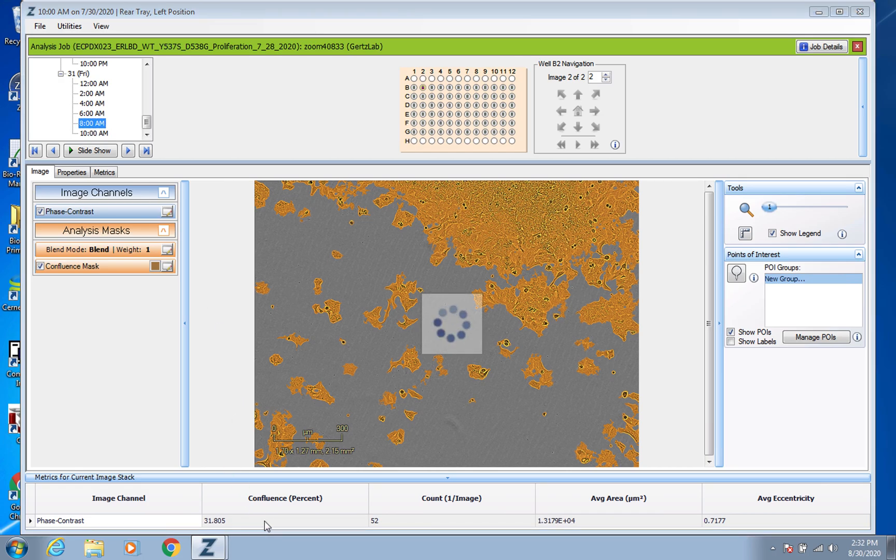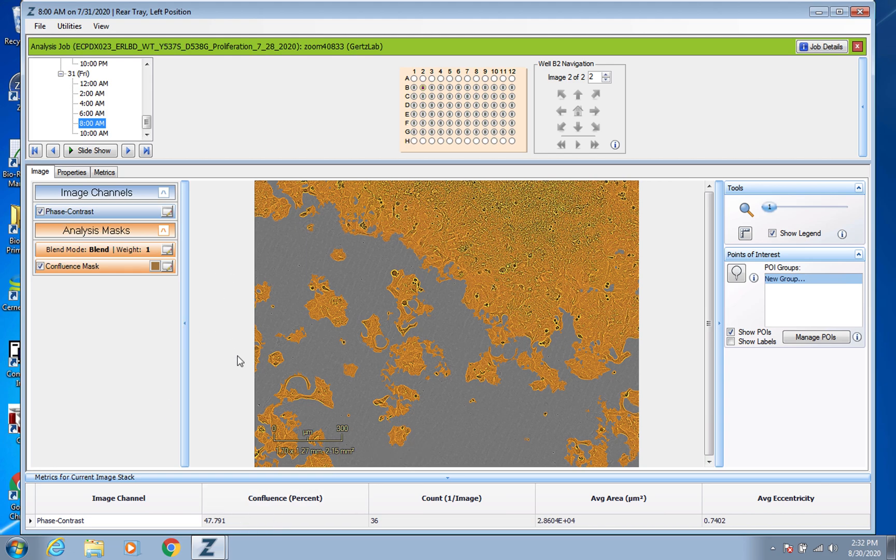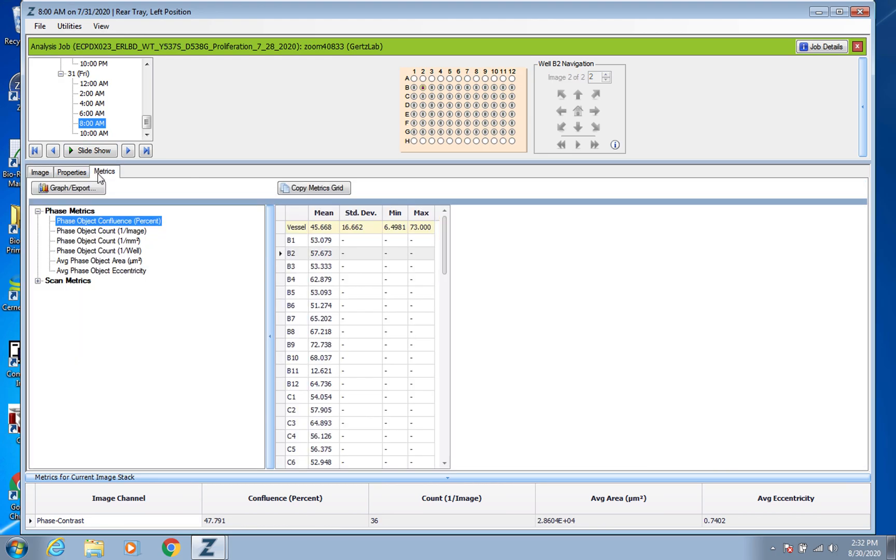And if you clicked on a different time point, you'd expect a difference in how many cells, and yep it looks like there's more cells and there's a higher confluence, which makes sense.